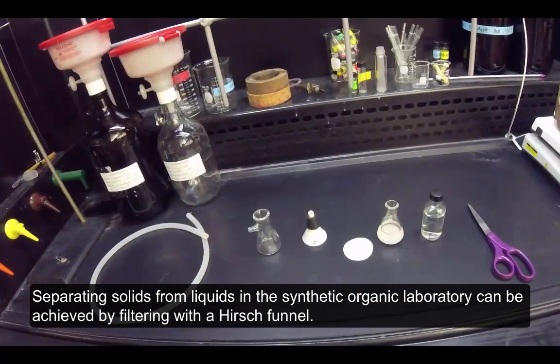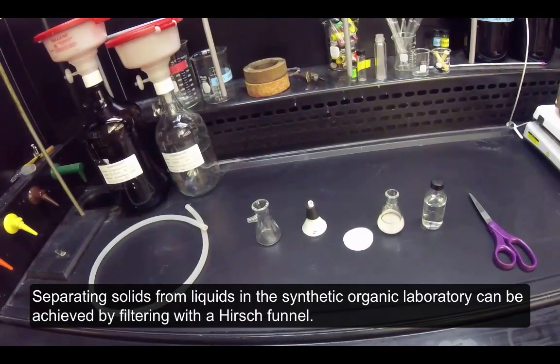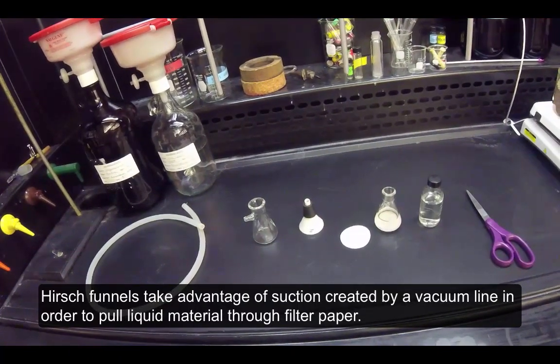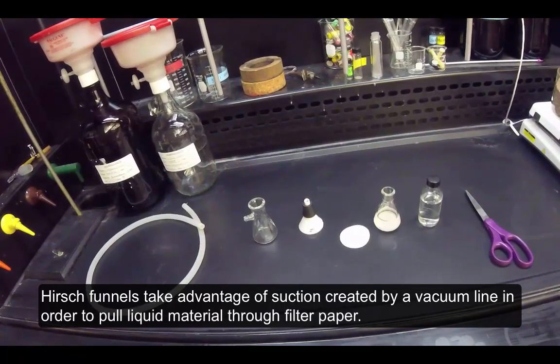Separating solids from liquids in the synthetic organic laboratory can be achieved by filtering with a Hirsch funnel. Hirsch funnels take advantage of suction created by a vacuum line in order to pull liquid material through filter paper.